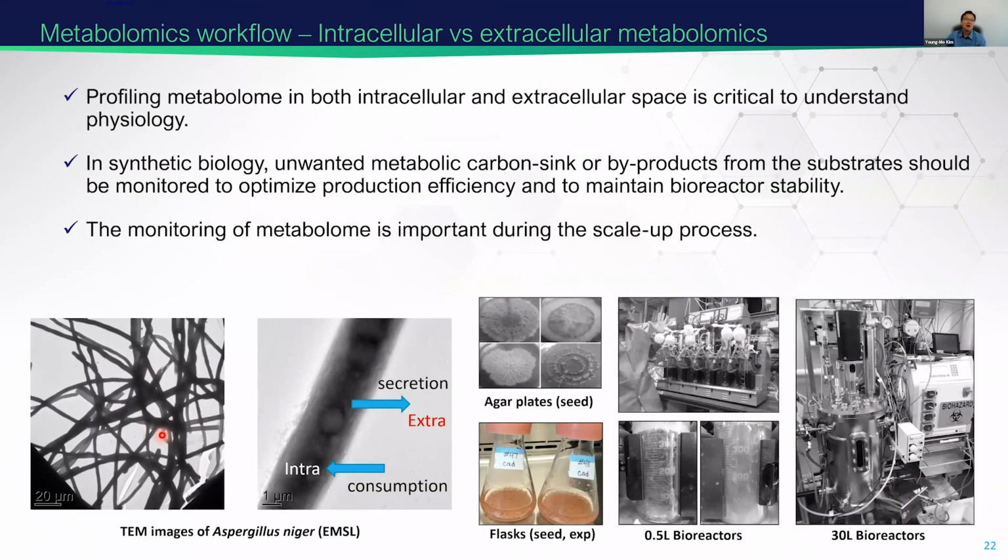And then I want to talk about intracellular versus extracellular metabolites, especially for synthetic biology research. A lot of metabolites exist outside, but we don't know what's happening inside if we only measure the extracellular metabolites. That's why we want to measure both intracellular and extracellular metabolites.